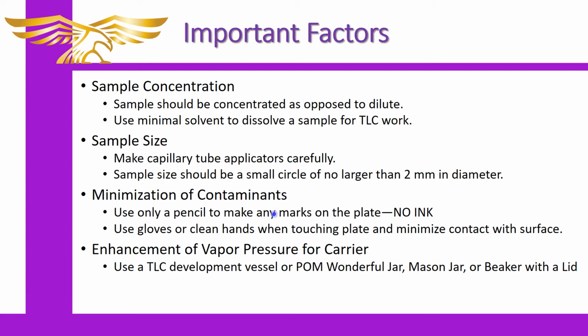The other factor, aside from using appropriate marking tools, is that you need to avoid touching the material on the top of the plate with your hands. You should either wear gloves, or you should hold the plate by the edges of the plate or the corners instead of holding it on the material.